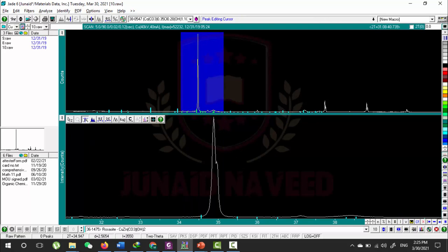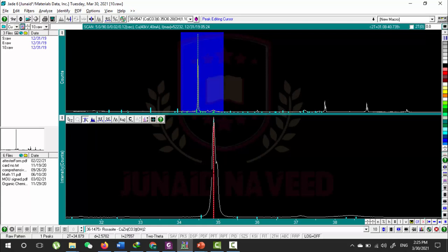With this, so let me magnify first. You can see I magnified this peak and I selected this option.